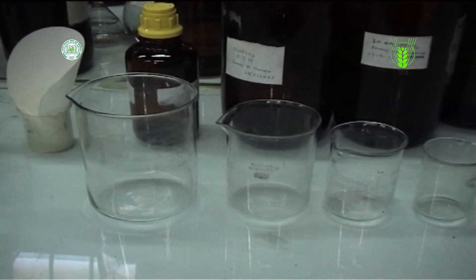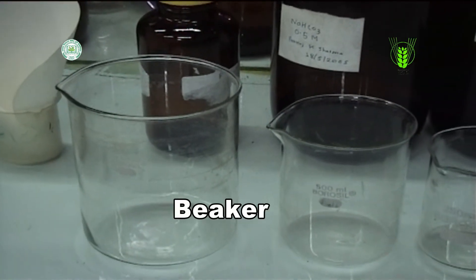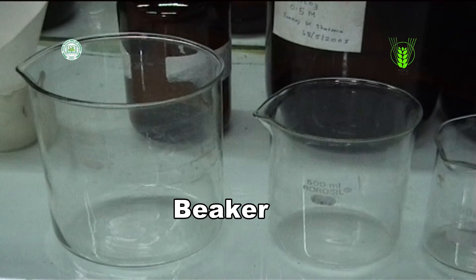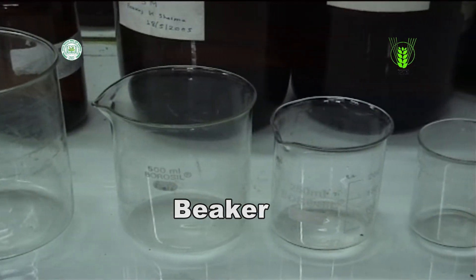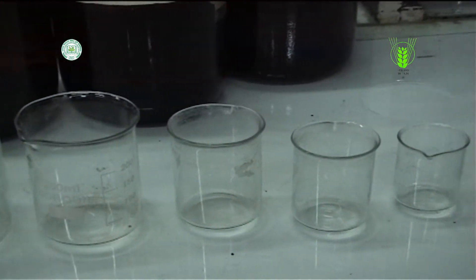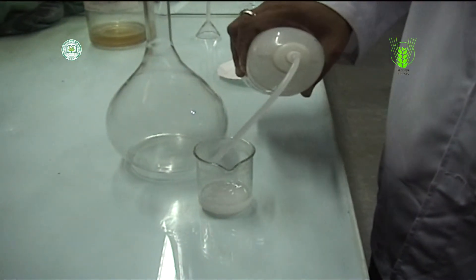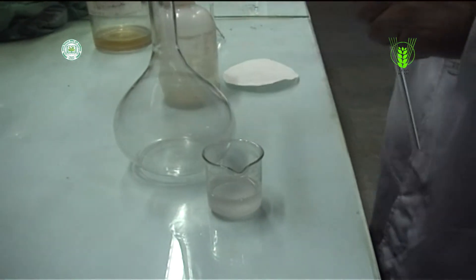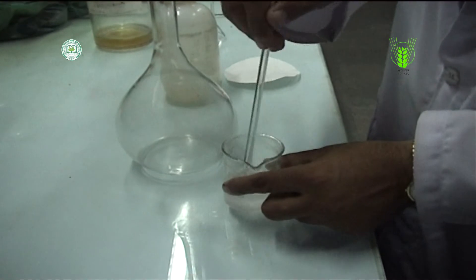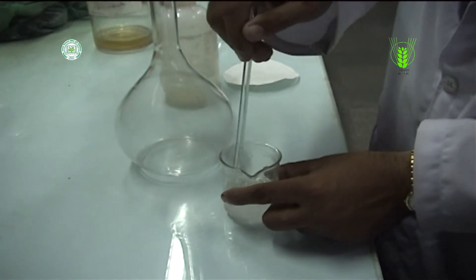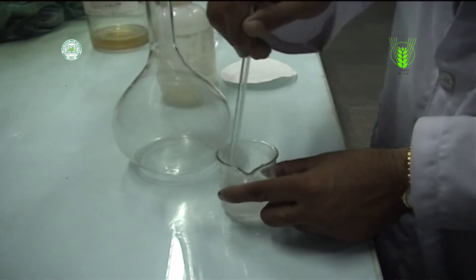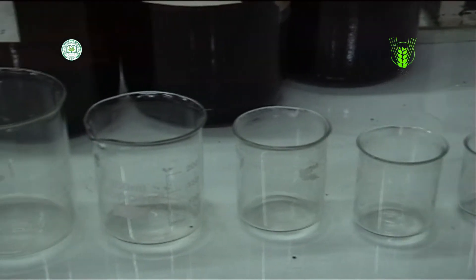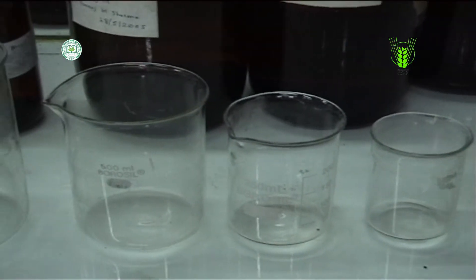One common glassware is a beaker. These are beakers. It is a simple container for stirring, mixing and heating liquids commonly used in many laboratories. Beakers are generally cylindrical in shape with a flat bottom. Most also have a small beak or spout to aid pouring as shown. Beakers are available in a wide range of sizes from 10 ml up to several liters.